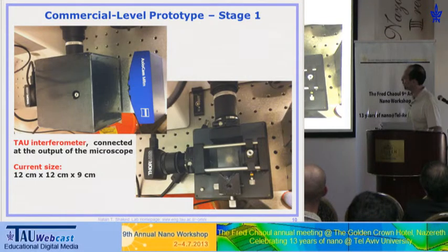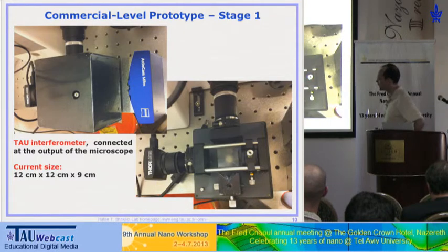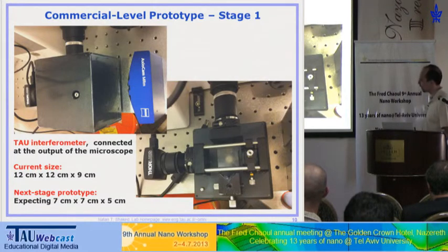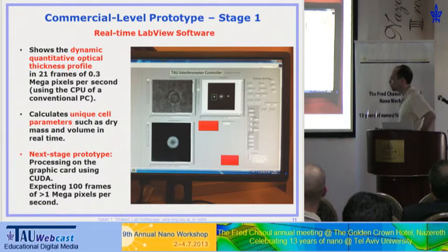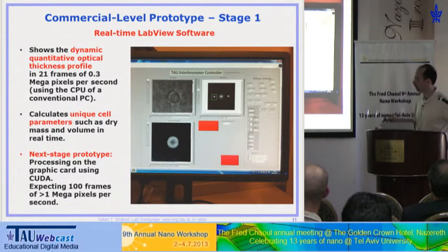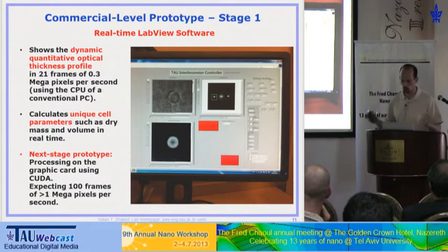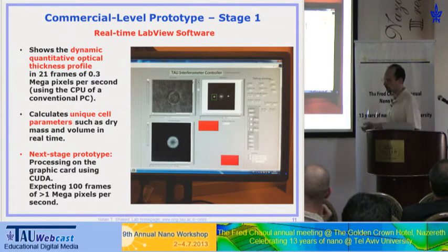This is how it looks with the box removed — it's just a simple beam splitter, a retroreflector, and a mirror with a pinhole. The alignment needed by the user is quite easy — just a single knob. The next prototype we expect to be 7 cm, comes with real-time software, and in the next stage we hope to run on the GPU using CUDA, expecting much more than video rate — about 100 frames per second — so the clinician will be able to see the phase profile of the cell, for example a red blood cell, in real time.